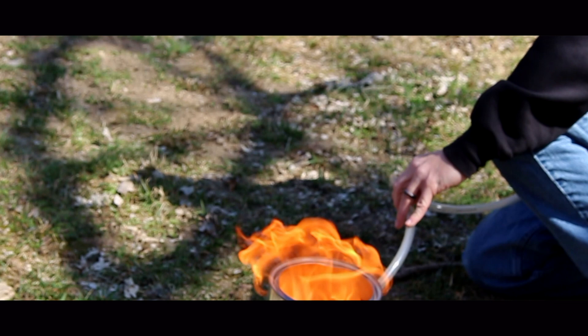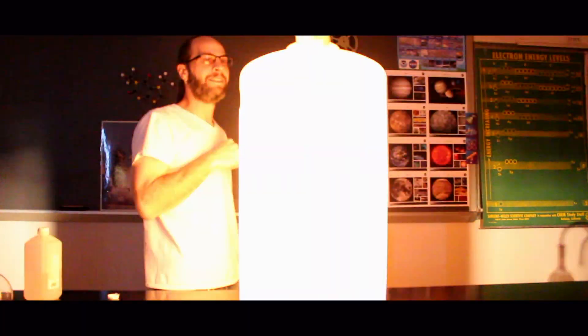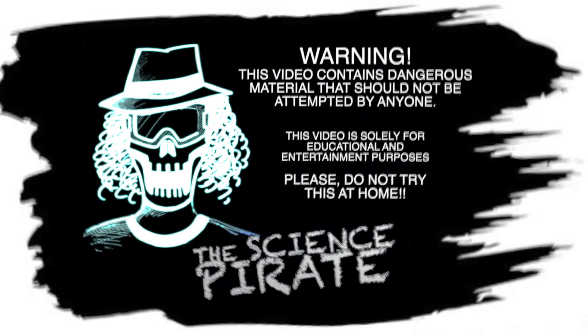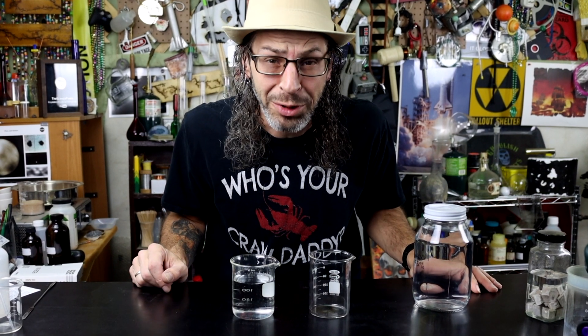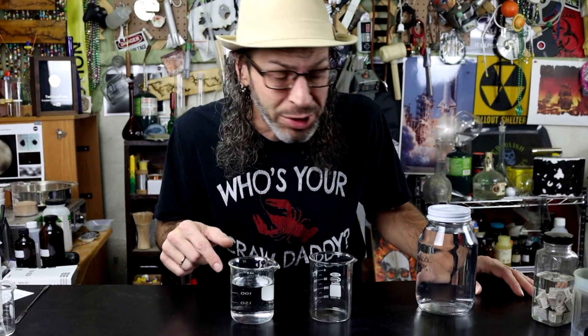Hands on deck! Holy cow! Most of us probably remember what happens if you put sodium metal in water, but if you don't remember seventh grade science, I thought I'd go ahead and show you here.